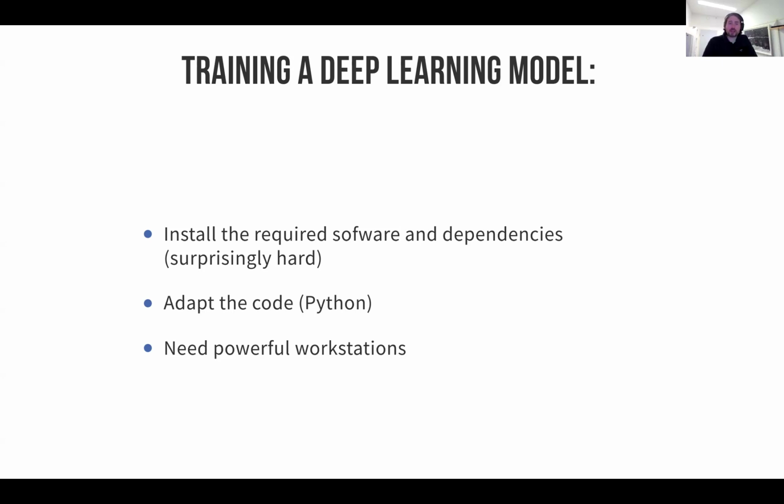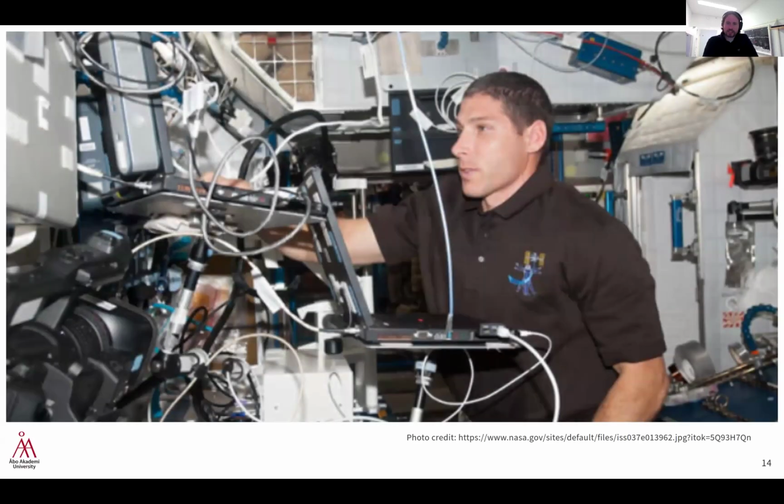You also need to access computing power, because you generally need at least a fairly powerful workstation and graphic cards to be able to work with these tools for the training. At the time when we got started, we were spending days trying to work out why the software developed by others couldn't be used on our own computers. It was really a struggle.